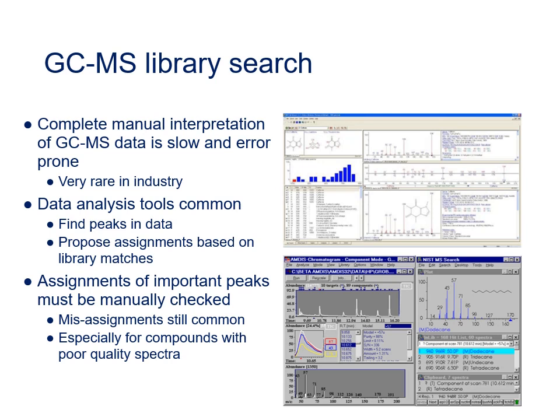Therefore, in most industrial situations, the data from GCMS analyses will be processed using automated data analysis software that will extract the mass spectra of all the individual components in the mixture and send them to a library of reference mass spectra for identification. This process is very much faster than manual interpretation, but is not a magic bullet.